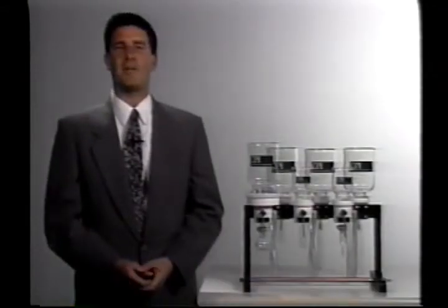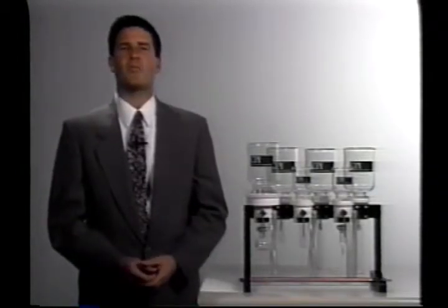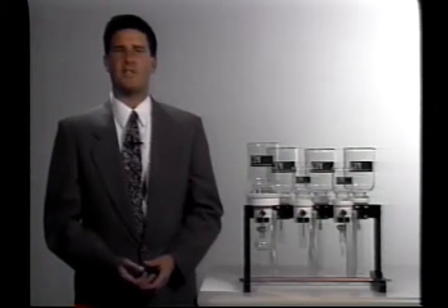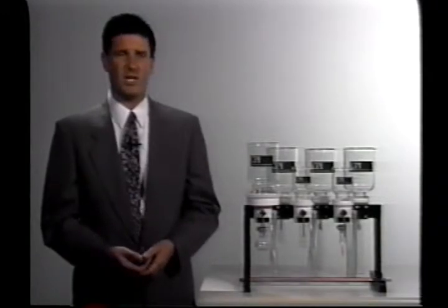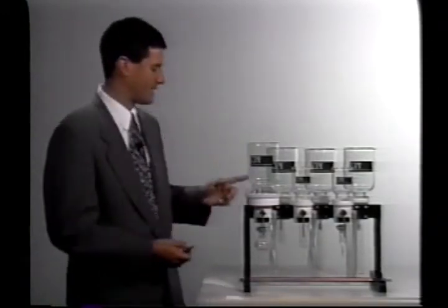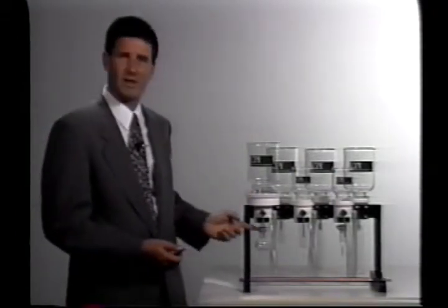One goal that CPI had in mind while designing and producing this manifold was to come up with a product that would be very flexible in your laboratory. We were able to achieve this by producing a manifold that gives you very many options as far as the number of stations you choose to use, the size of sample reservoirs you choose to use, the size of the extraction stations themselves, and also the type and size of collection vessels.